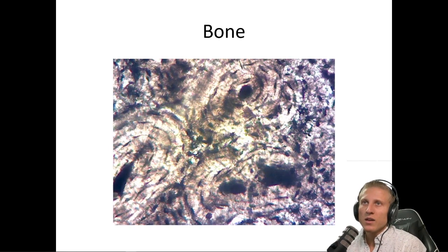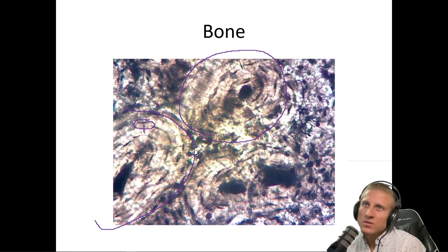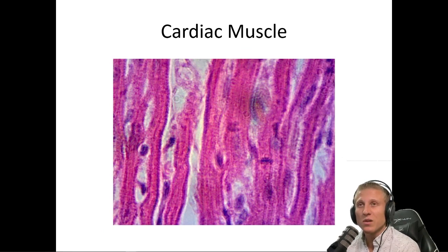Here's bone. Again, the osteon would be this process right here. And then these are the lacunae, where the osteocytes, the living cells, would be. Those little tiny lines, those little striation-looking things, are tiny little tunnels, which we'll cover maybe more on another day. But that's how they communicate with each other and send nutrients back and forth. It's also how they detect pressure differentials in the fluid running in those chambers to determine whether or not the bone needs to reinforce itself due to excess strain.